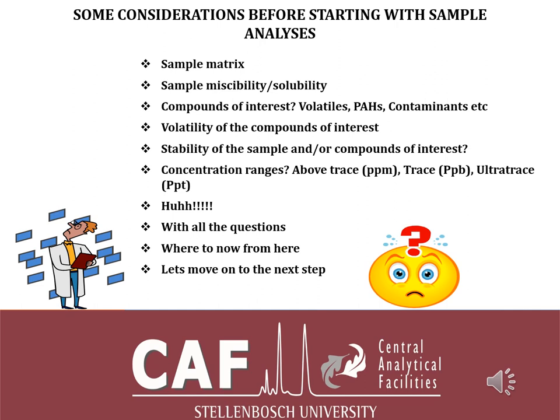Also, the volatility of your compounds of interest. How volatile are your compounds of interest? It is important because if your compounds of interest are very volatile, you may have to keep them at a cooler temperature so as not to lose them. Or maybe also the stability of your sample or compound of interest. If your sample is very unstable, you might have to keep it in a cooler condition, or do the preparation in a cooler environment.